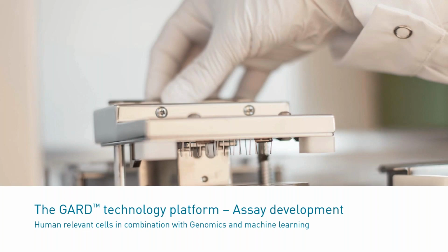What I really would like to emphasize in this presentation is that the GARD assay is not actually one single assay, but it's rather a testing platform on which you can base several different toxicological endpoints. I will now talk more about the GARD technology platform, how the assay was developed, and how human relevant cells in combination with genomics and machine learning creates the base of our in vitro assay.